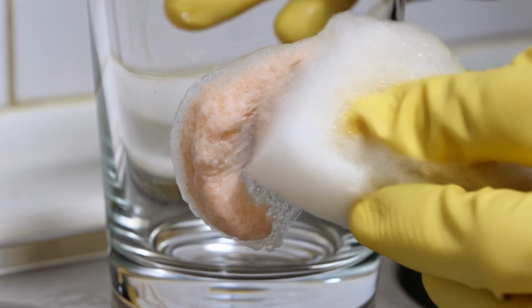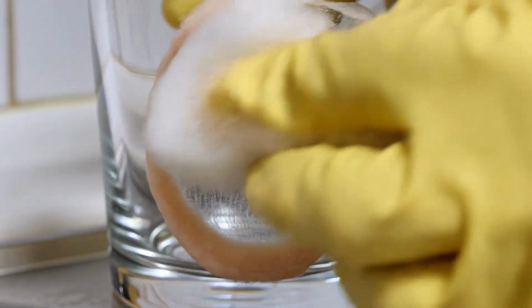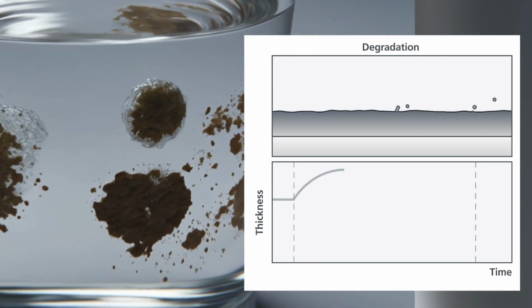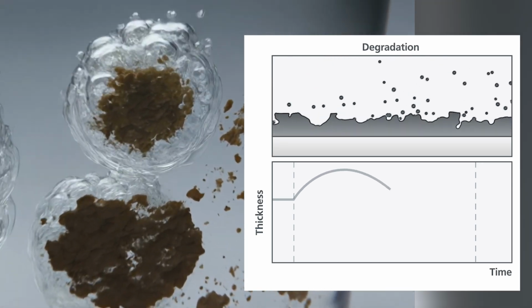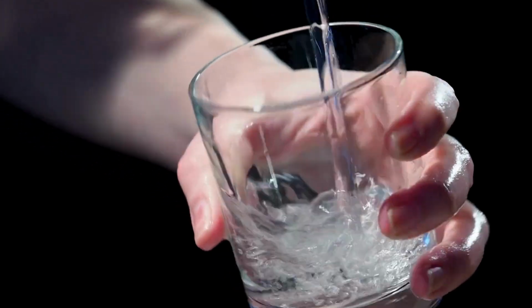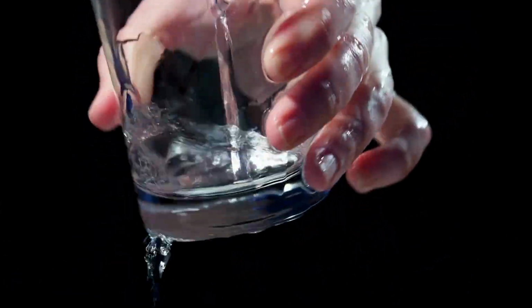Consider something familiar. A cleaning agent removing soil from a drinking glass or a piece of industrial equipment. We expect detergents to lift dirt and wash it away. But with QCM-D we can actually measure how molecules from the cleaner first swell the soil and then detach it from the surface, second by second. The everyday act of cleaning becomes a quantifiable surface interaction.